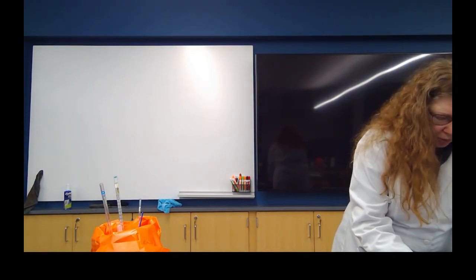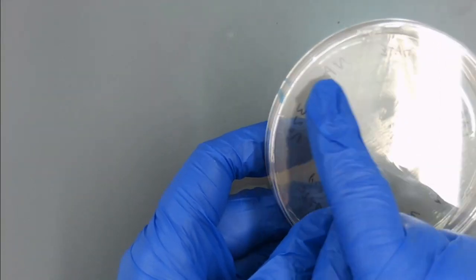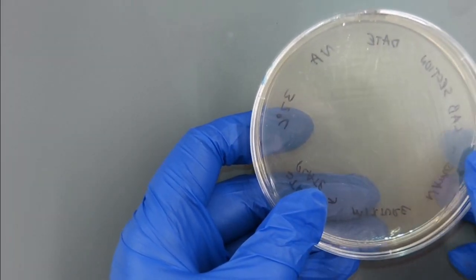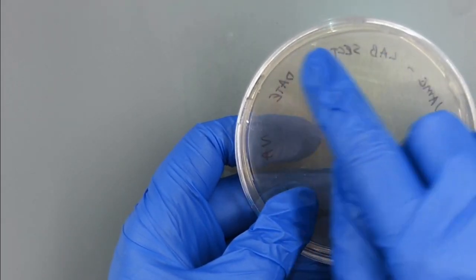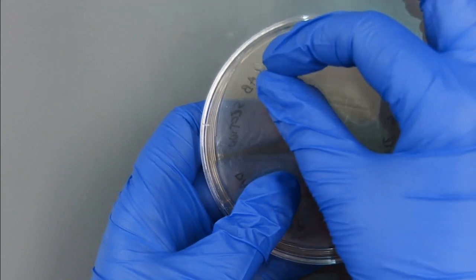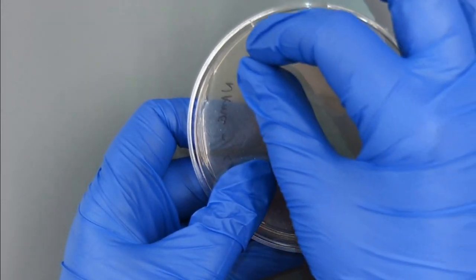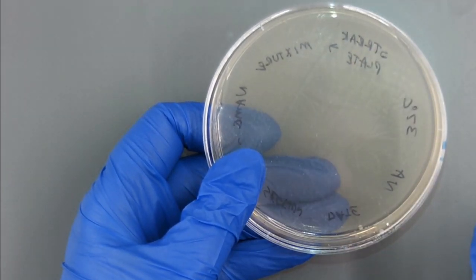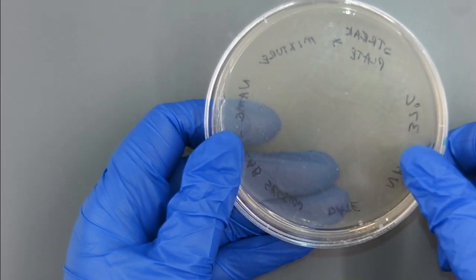Now what's going to happen with our plate when we incubate it, this initial set of streaks is the one that has the most bacteria. So that will be just solid growth. But as we go around, because we've dragged it out, this section here will have a little bit less bacteria than the first one. And this one will even have less because we've taken the bacteria already on the plate and pulled it in this direction. And the same you'll see here. As we go in this direction, there'll be even less bacteria, and then in the middle, we'll have the fewest amount. So you should see heavy growth, lighter growth, and eventually we should wind up with pure colonies.